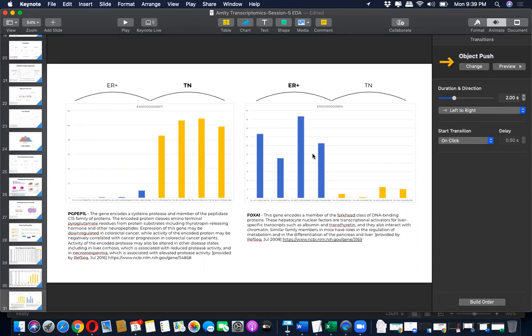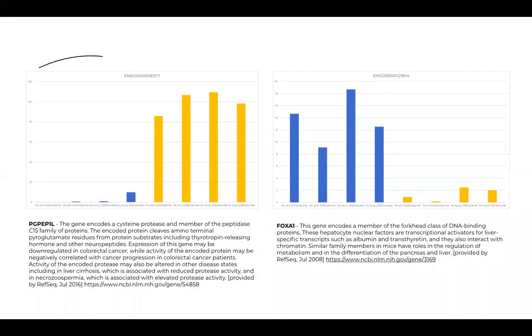So the point that I was telling you is that after the analysis, after we saw that table and did some plotting, we found some interesting genes that could be critical for breast cancer. You can do good quality research yourself using the available data set. That is an opportunity. This is one way of doing biological interpretation, by knowing how things influence each other.